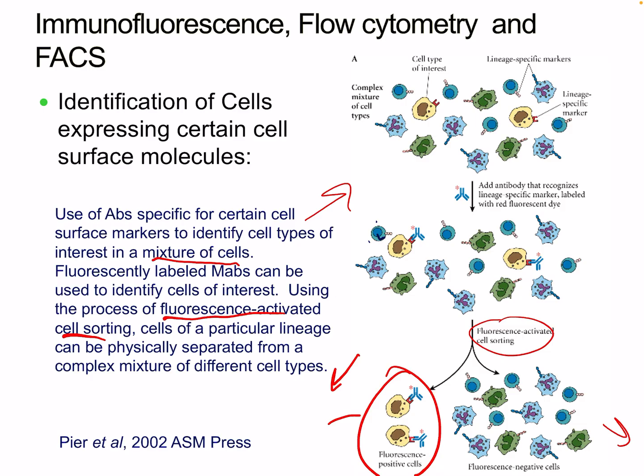So guys, I hope you enjoyed our last lecture on flow cytometry. This is probably a more advanced topic that you wouldn't see in most labs. I know in my lab at school we don't have it because they're quite expensive and you need trained technicians. There are 3-year programs dedicated to being a technician for these machines. They're quite advanced, but a lot of big school labs have flow cytometry because they can do a lot more advanced studies. So if you go to a bigger school, they may have one.